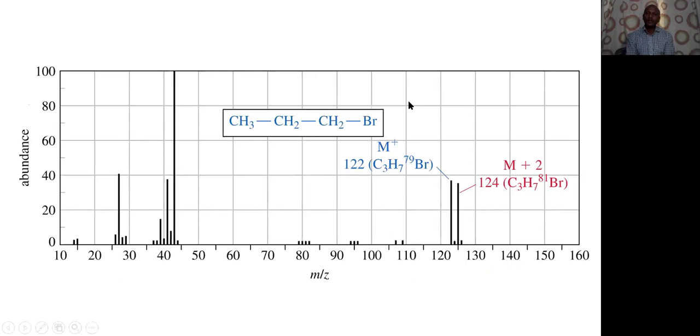Here, you have the break, that is loss of bromine, with the M/Z value M minus bromine, and then you have the cleavage of the alpha carbon atom, which you can also expect, and you can see prominent molecular ion peaks, and you can differentiate them. Whether it is bromine or chlorine, how do you differentiate? In chlorine you have the M+ and M+2 peaks, and in bromine also you have the M+ and M+2 peaks. In chlorine, the M+ and M+2 peaks are in a 3:1 ratio, whereas in bromine it is almost a 50:50 ratio, and the fragmentation probability is the same.